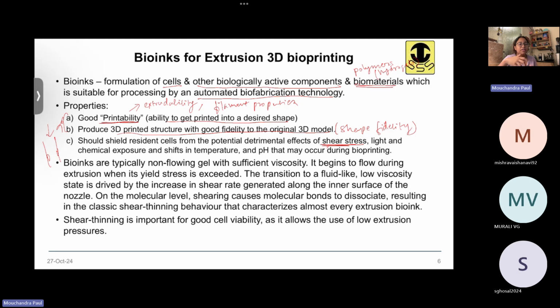So it's 3D. The hydrogel is usually loaded in solution form so that it is easy to load. If it is already gelled, it will be very difficult to load in the cartridge. When it is in solution form, the cells are homogeneously mixed, so many cells will be near the wall and many inside. You cannot see the cells exactly in the cartridge, but any cells near the wall will face the highest shear stress level. That's what I was talking about.